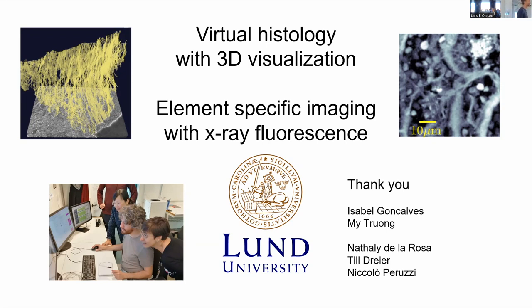Sure. I'm not working with atherosclerotic plaques, we're working with lung samples, but usually if we go to the beamline, with 40 hours of beam time we can scan maybe 100 paraffin blocks. We scan maybe three areas per block. And then we usually section the top section to look in the microscope and decide, okay, this area we would like to focus on. We get a lot of data. It's fast. I would say this is definitely feasible.